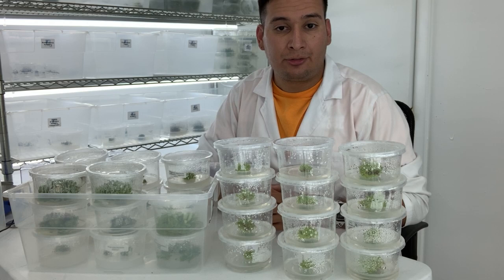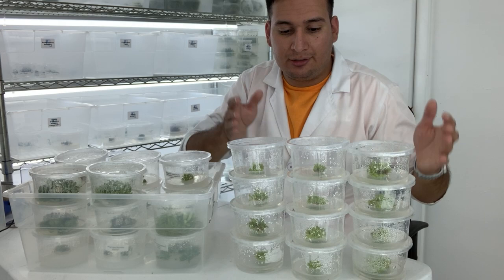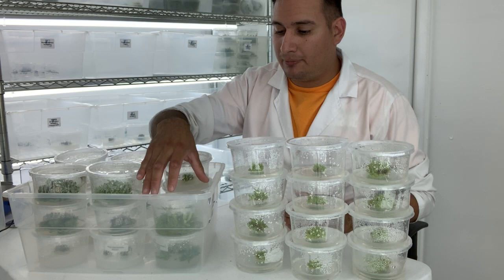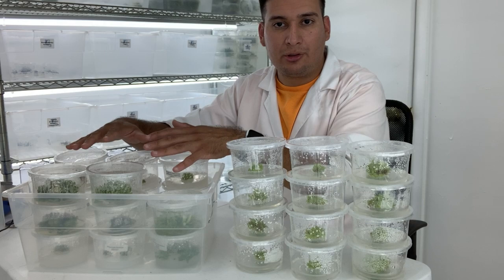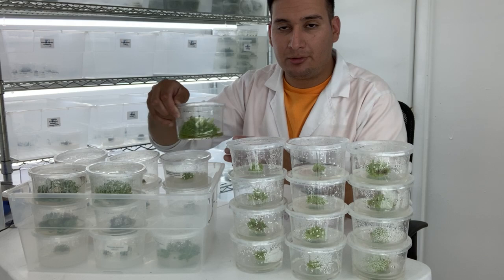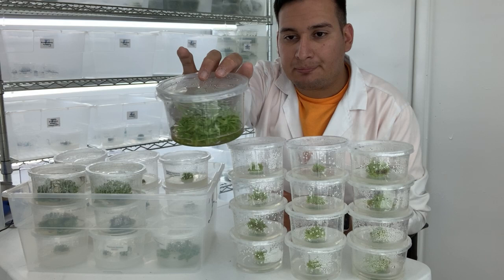We are done with the plant tissue culture, and this is what we did today. This is definitely not 10,000 dollars worth of plants yet — hear me out. I keep 18 containers at all times. What I did is I took one container, and as I showed you before, each of these containers has at least 100 plants.